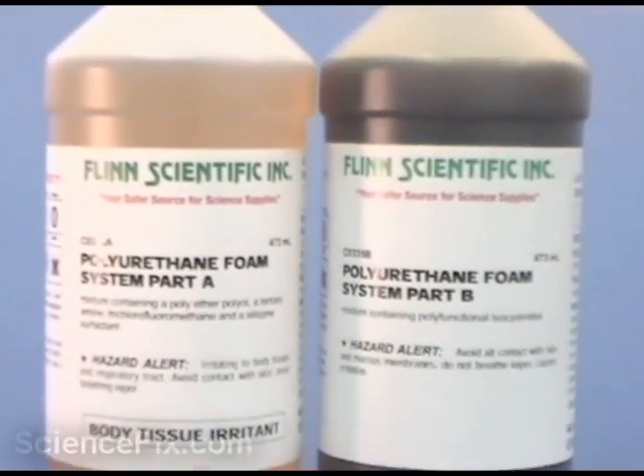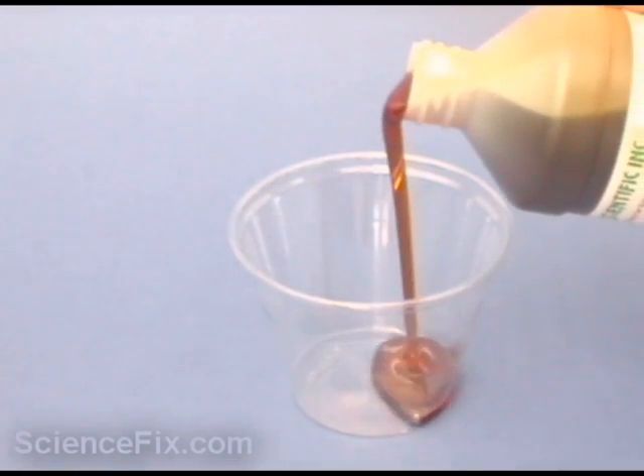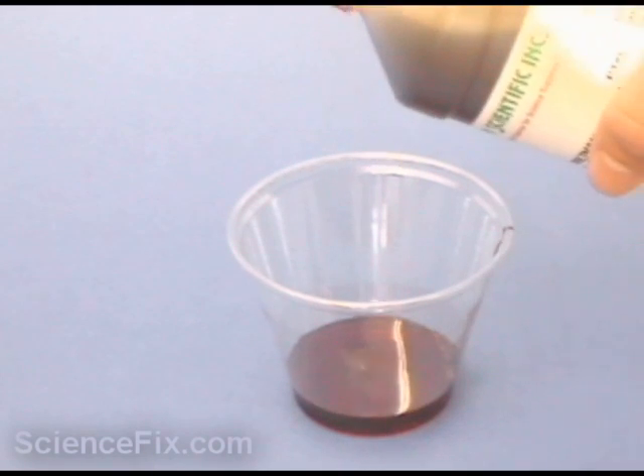Here we have a polyurethane foam system from Flinn Scientific. We have two different monomers — part A and part B. The two monomers are mixed together in a cup.